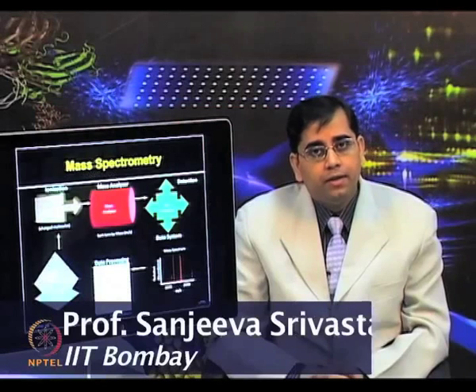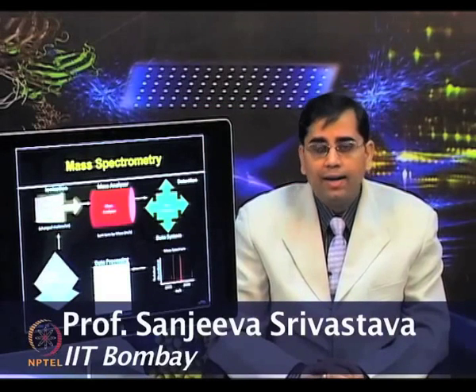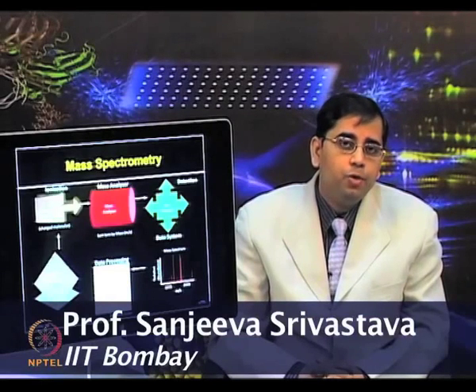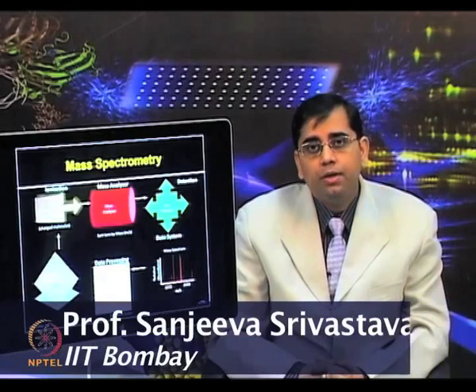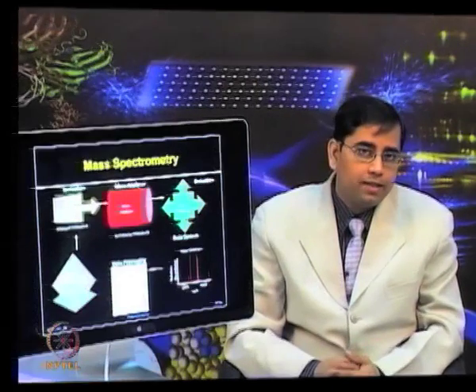Mass spectrometry has become the method of choice for analysis of complex protein samples in proteomic studies due to its ability to identify thousands of proteins.